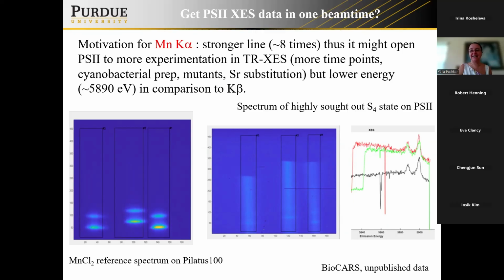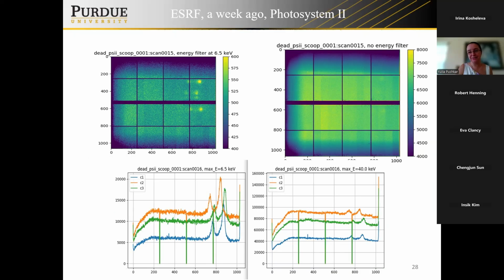So I was kind of excited. We got some data there, not spectacular because of other reasons, but I see a light at the end of the tunnel, in how the combination of spectrometer design and new detectors can make time-resolved X-ray emission from a very exclusive niche into a more mainstream technique, which can be straightforwardly combined with crystallography.